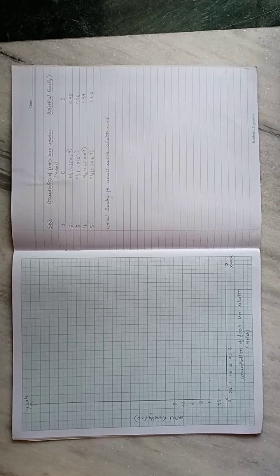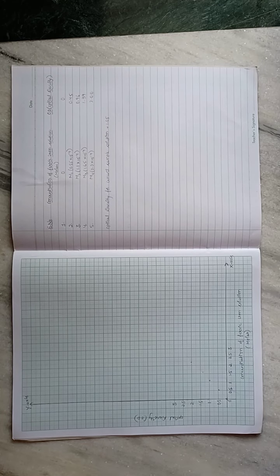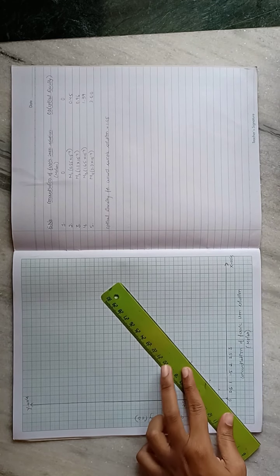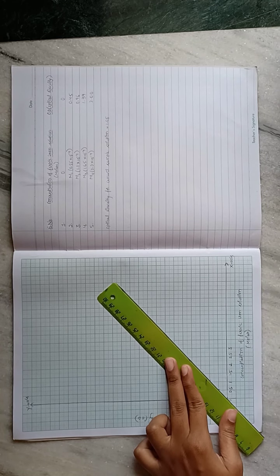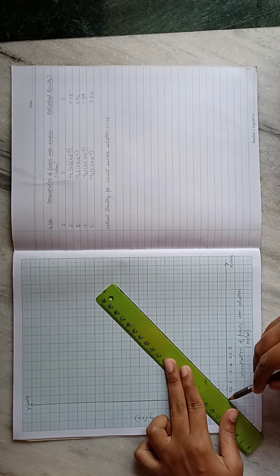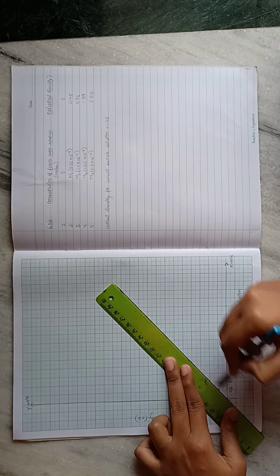Now we have to join as many points as possible through the origin. We will get a straight line like that.